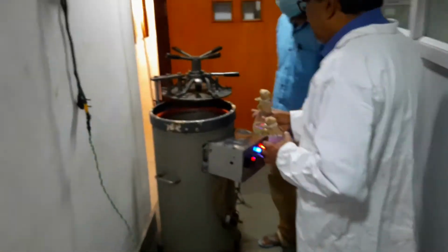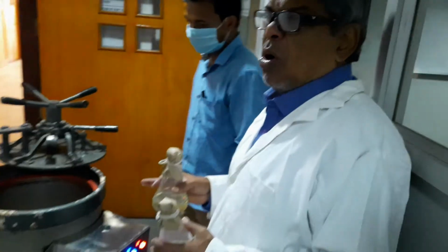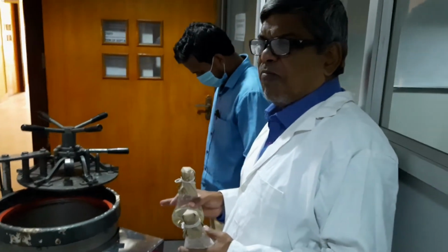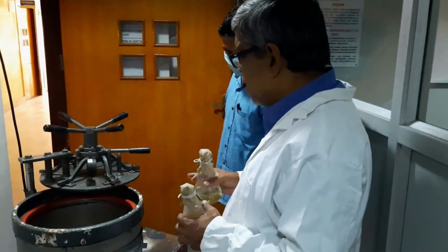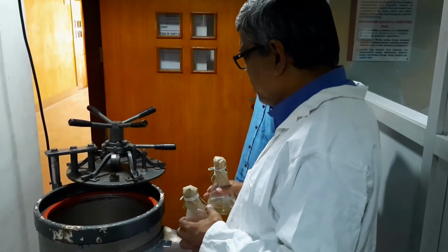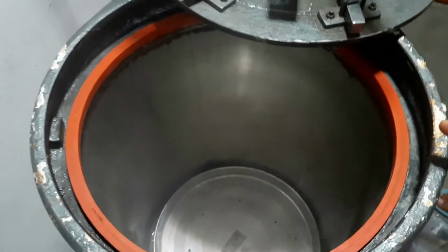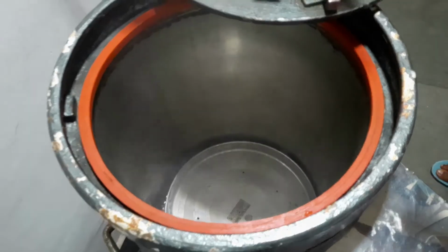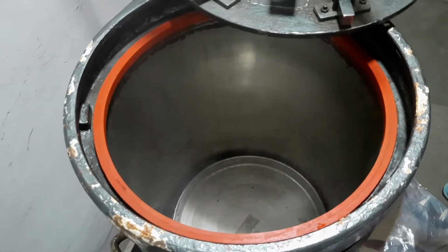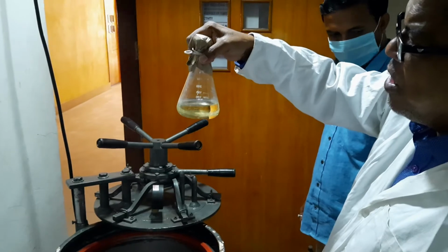This is the autoclave machine, at 121 degrees centigrade, 15 pounds per square inch. It will be autoclaved. Water is given in the bottom for moisture formation, and it is absolutely tight. No moisture can escape from inside, no moisture can come into the inside.